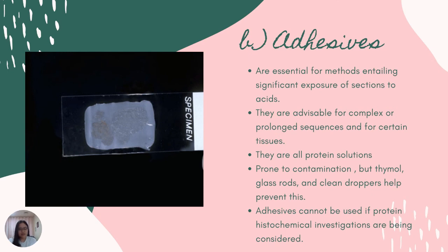Now this is used because it provides a strong adhesion between the glass and the tissue sections. Although adhesives do not play significant roles during the staining process, they are essential for methods entailing significant exposure of sections to acids. They are also advisable for complex or prolonged sequences and for certain tissues, such as the nervous system and the bones.